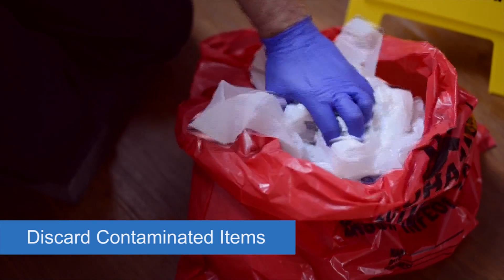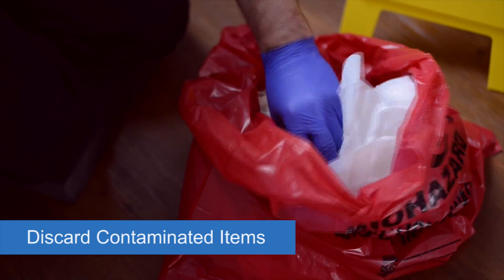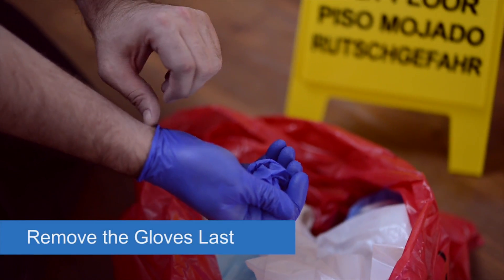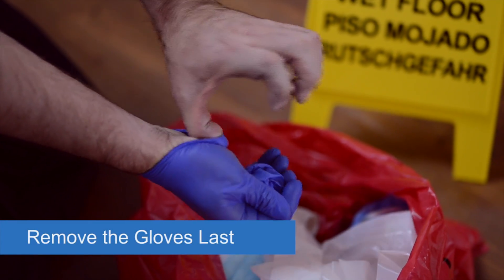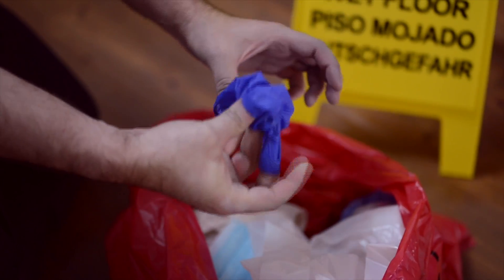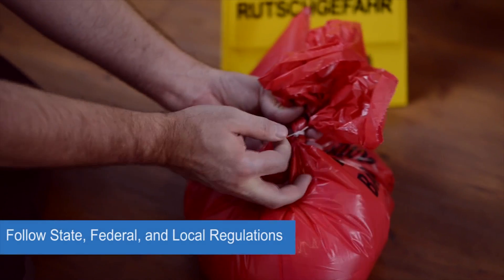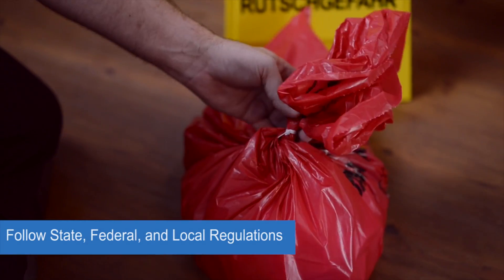Once the spill is clean and disinfected, place the remaining contaminated materials into the outer red trash bag. Remove the gloves last and make sure not to get any blood or fluids on your skin. Tightly seal the outer trash bag and dispose of the bag as required by local, state, and federal regulations.